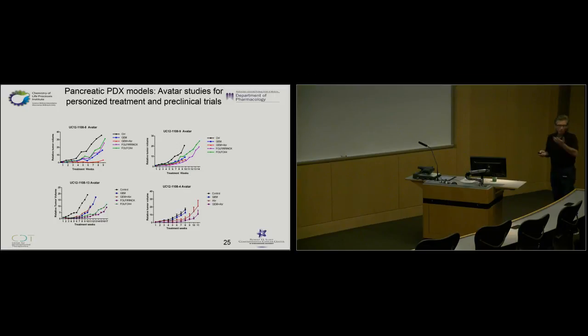And to go back to your point, these are small n size. These are like 1 or 2 mice. But we'll do 2 tumors on each mouse. So you might see 4 tumors total. Other patients, this one pretty much nothing works. You maybe slow down progression a little bit, but not really. Maybe a little bit of something here, a little bit of something here. I think this just highlights, number 1, that these PDXs retain the difficulty of treatment that you see in the patient. And then number 2, trying to identify something that's active for that patient may actually help.